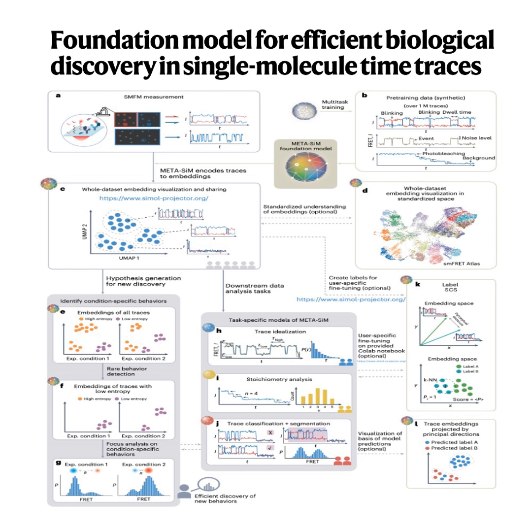Idealization. That sounds like smoothing out the noise. It's more than that. It's about taking that raw, noisy signal and extracting the underlying, sort of ideal, step-like transitions between distinct states, like different FRET levels. This gives you the kinetic parameters, the dwell times in each state. It's something often done using older methods like hidden Markov models, HMMs.